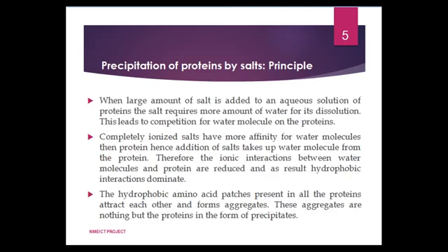During ammonium sulfate precipitation, the salt has to be added in a small amount under constant stirring to avoid accumulation of high concentration of salts. When a large amount of salt is added to an aqueous solution of proteins, the salts require more water for their dissolution.